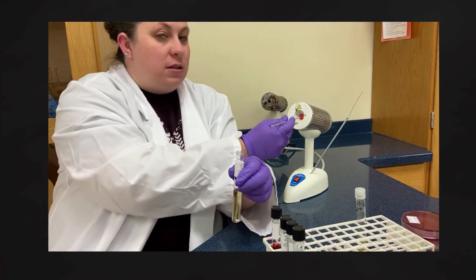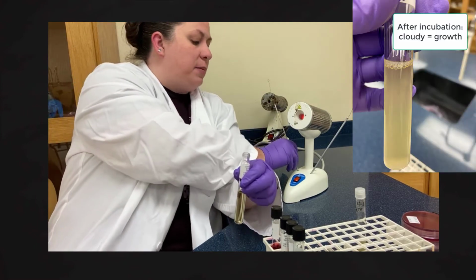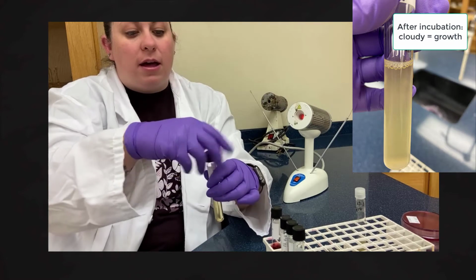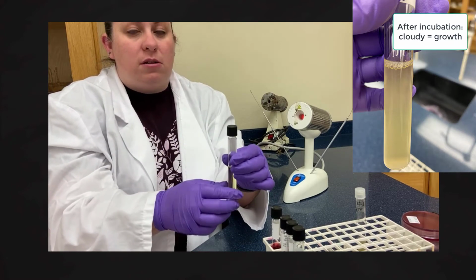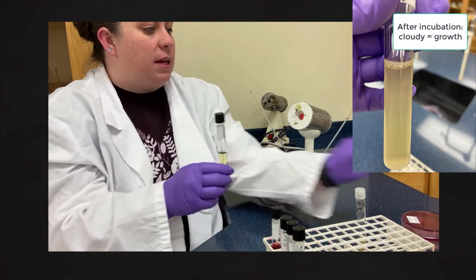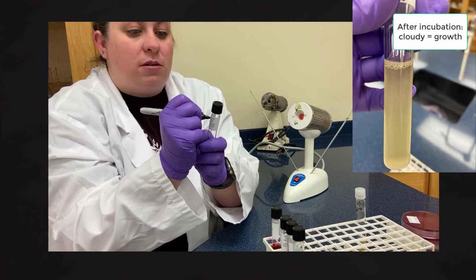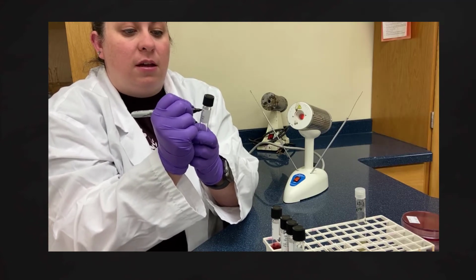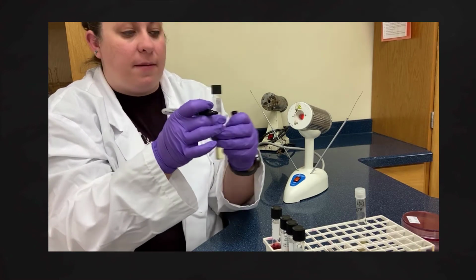Okay, now again, I want to sterilize my loop after I'm done with that. Putting the lid back on, I want to tighten it all the way and then unscrew it 1/2 of a turn in order to make sure that the gas can be released. So in this case, I'm again going to put my initials and what it is.